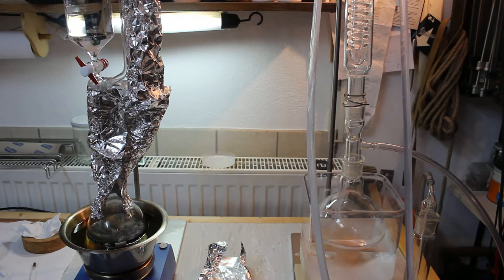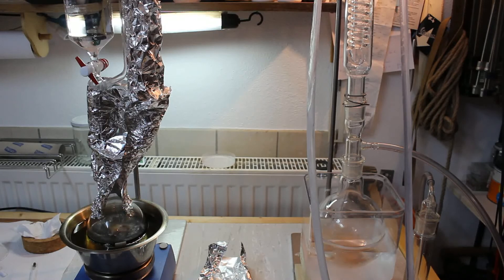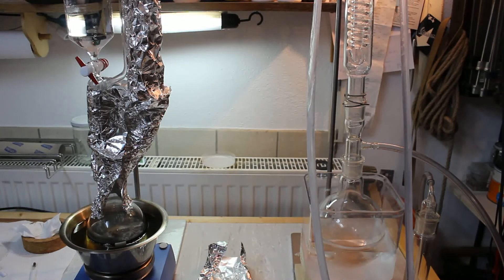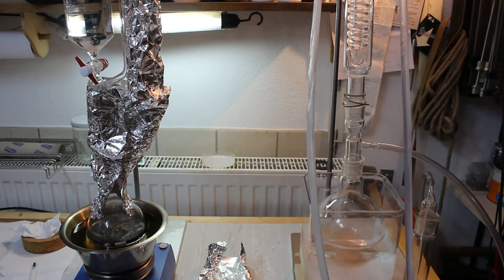Since the acid is only catalyzing the reaction you can theoretically keep distilling over as much ether as you want as long as you keep adding fresh ethanol. In reality the sulfuric acid is consumed in side reactions so the amount of ether you can distill off is limited. I started out with 300 milliliters of additional ethanol in the addition funnel and I think this should produce enough ether for all my upcoming experiments. So I'll be stopping the distillation once I've added all of my 300 milliliters. But I'm sure you could go a longer way with the sulfuric acid we added.